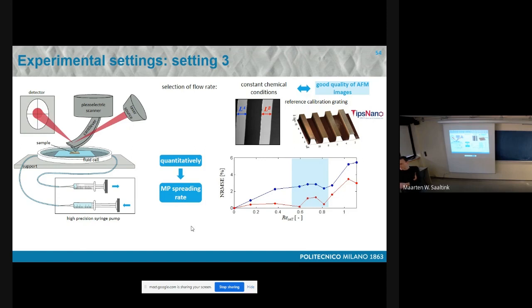But you have a relatively flat surface where you have, yes, a little bit of dissolution, but it's hard to tell the difference, but in any case, much smaller. If you don't have absolute values, all we can say is that it is much smaller. So I say that because to me, this is a clear description. And if I were to describe it stochastically, I would say, okay, how do those work? And when you show the several pictures, you can see them moving.